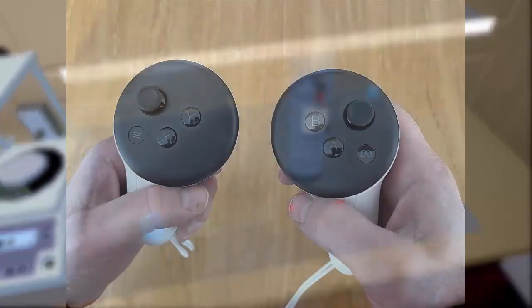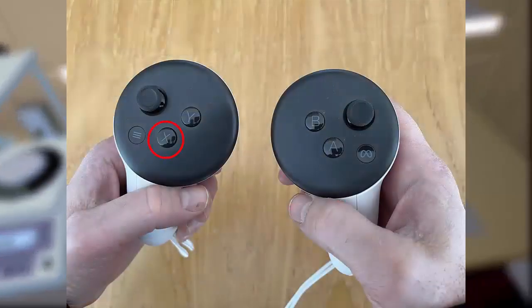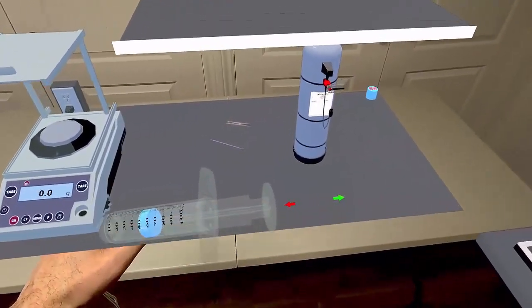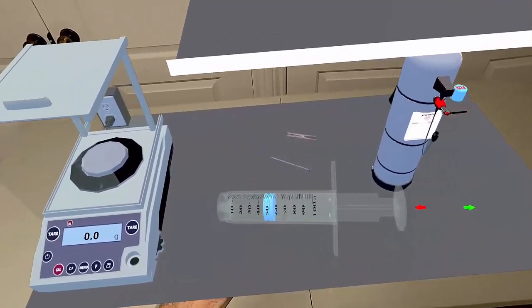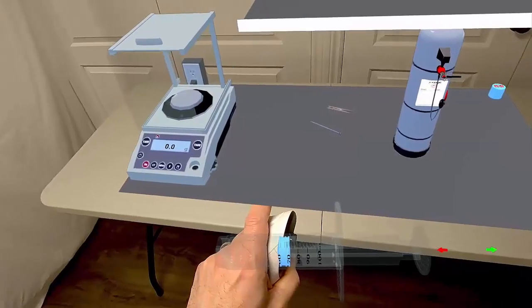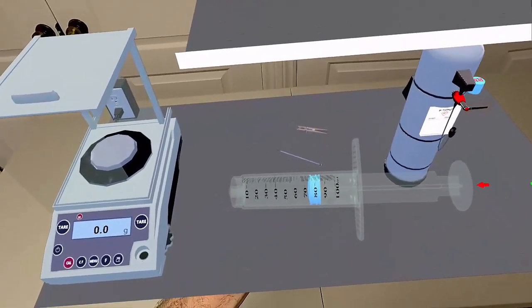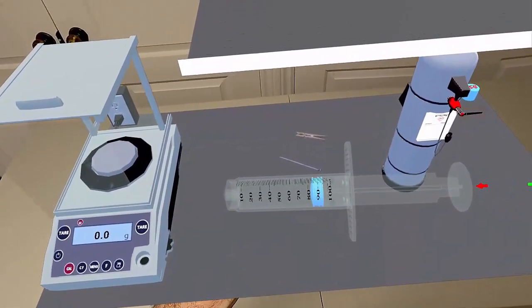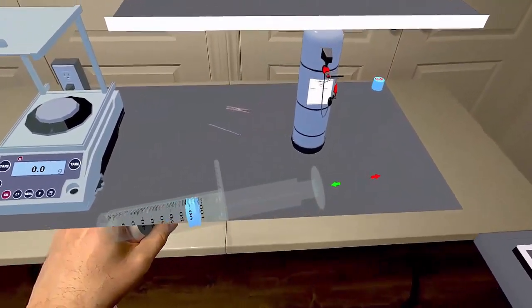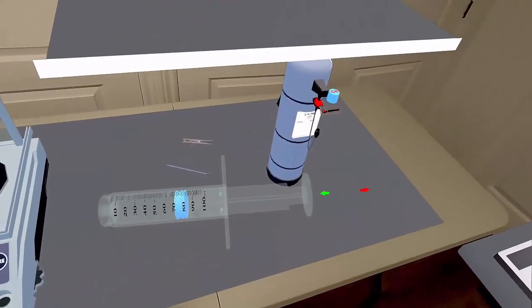To select either direction, you will need to press the X button when using the left controller, or the A button when using the right controller. This will alternately highlight one or the other of the arrows in green with each click. You will then just need to click the trigger button to move the piston in the chosen direction. Each click will move the piston by an increment of 5 milliliters. To change direction, click again on the X or A button, which will highlight the arrow pointing in the opposite direction in green.